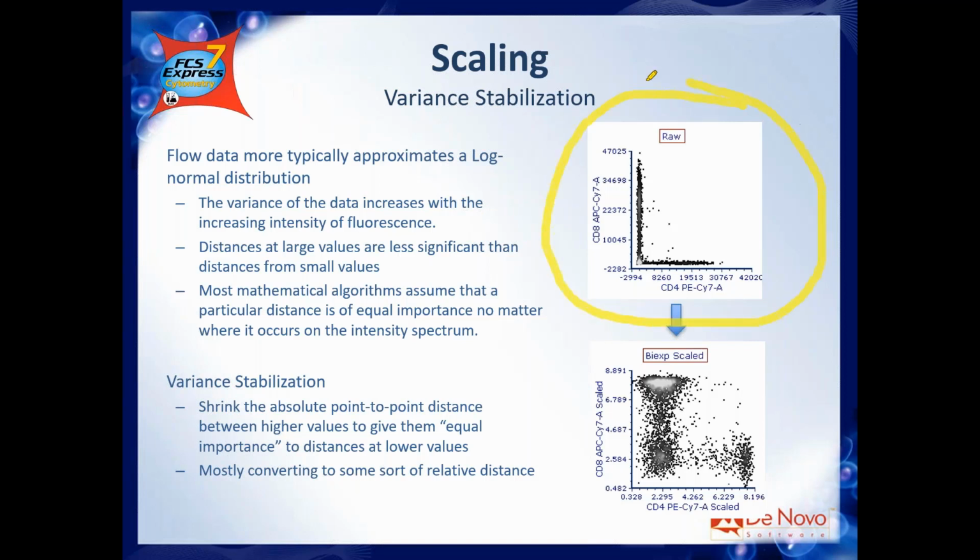So if you look at your raw data in your FCS file, they are saved this way. With linear scale, you see that the negative is really condensed and shrunk here, and then you have very spread positive populations. So it's not really user-friendly. It's not really easy to define which is positive, which is negative. This is why we usually apply a biexponential, but also a log scale or a hyperlog scale. So we prefer to look at the data this way, where you see the positive and the negative are definitely more comparable and more homogeneous in terms of spreading. While in this case they are pretty different.